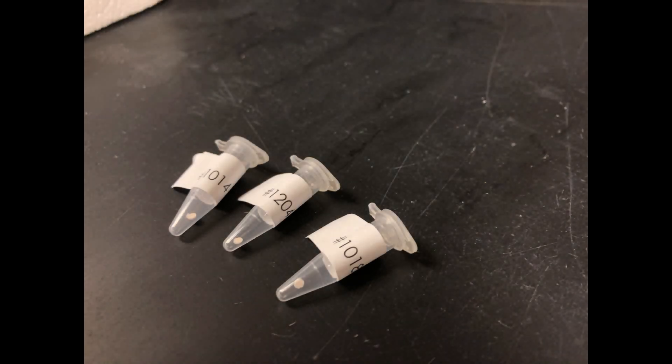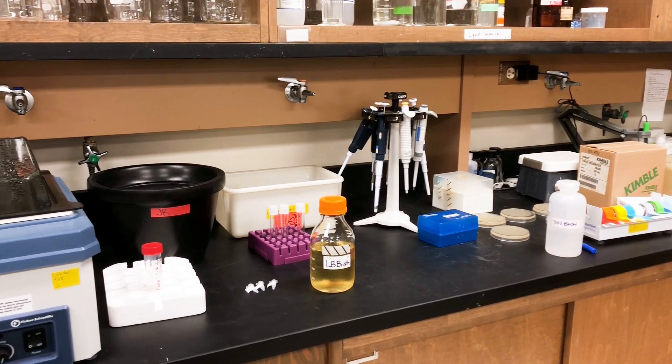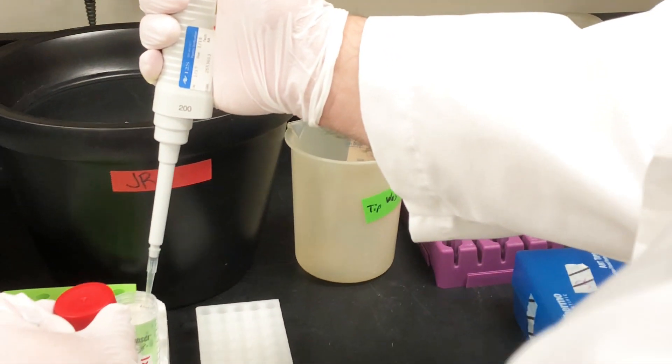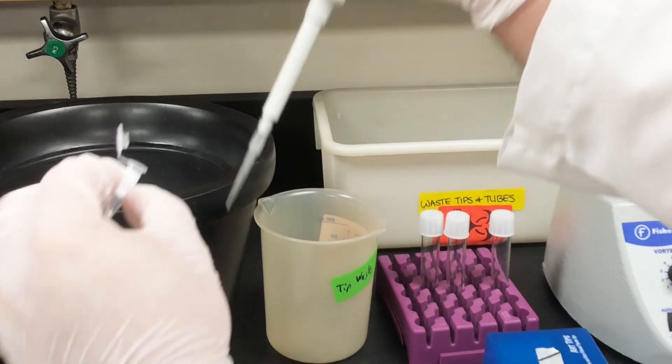This is the DGRC vector standard operating procedure for processing clones and vectors off of Whatman FTA disks. To process, add 50 microliters of 1x sterile TE to the microfuge tube with the clone disk.